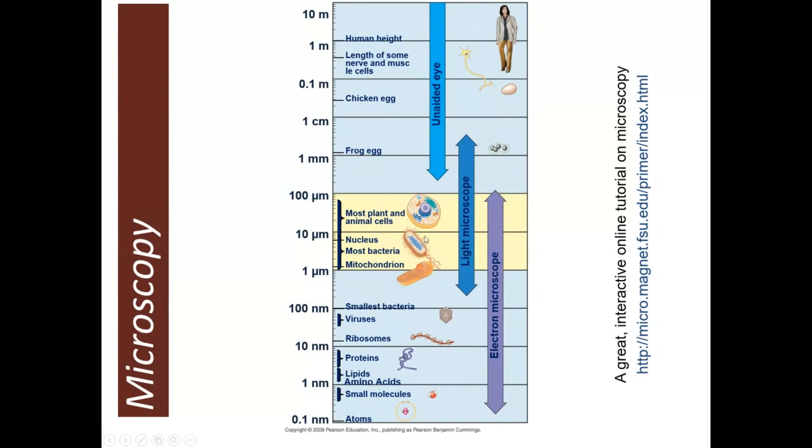So all those images that I showed you of the cytoplasmic streaming and the cheek cells, those were all under a light microscope. Now, we're going to talk about light microscopes today.